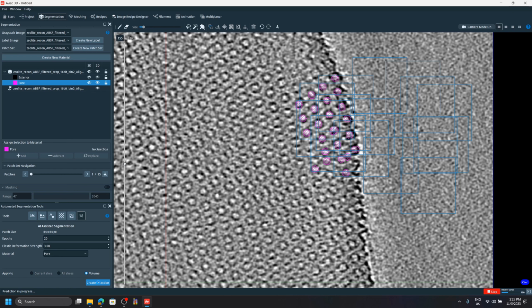It's okay if they overlap, but basically it's going to pull out those patches and treat them as different images, because under the hood it doesn't have to know that they're overlapping. It can just think, oh, these are different images. But you'll see that in the next example later.